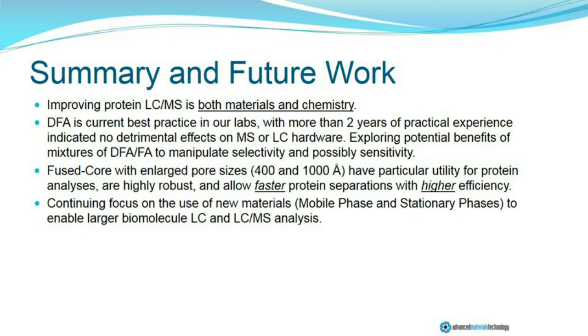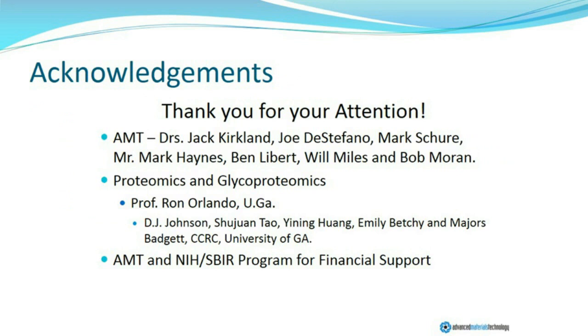The use of superficially porous materials, particularly those with large pore size, we have found to be greatly enabling in terms of allowing faster separations with higher efficiency. And with that, I'd like to thank some of the contributors we have had to this work, both internally at Advanced Materials Technology, some of our academic collaborators, and as well the support of the NIH SBIR program for the development of some of these chromatographic materials and methods of use.